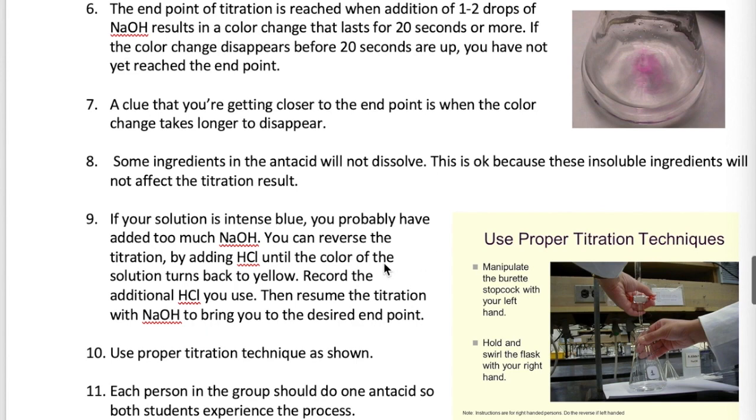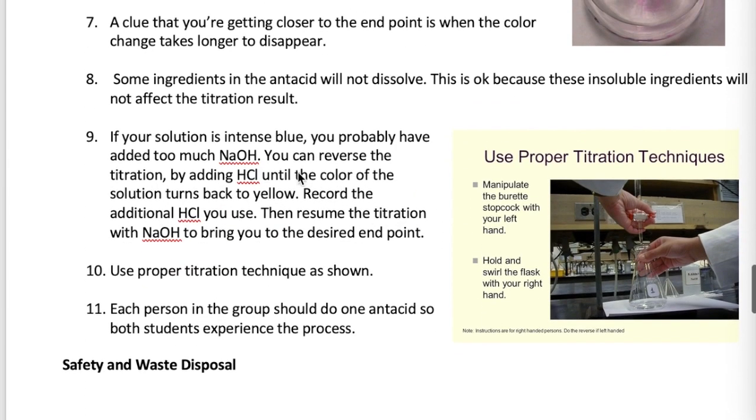Now, note that if you have an intense blue color, it's likely that you have gone way past the endpoint. This doesn't mean that you have to repeat the whole experiment again. What you have to do is reverse the titration. The way you do this is by adding HCl to bring the color of the solution back to yellow. After that happens, you can then slowly titrate back with NaOH to get the color to the endpoint of green or light purple. If you do carry out the reverse titration, make sure you record all the additional volumes of HCl and NaOH that you use.